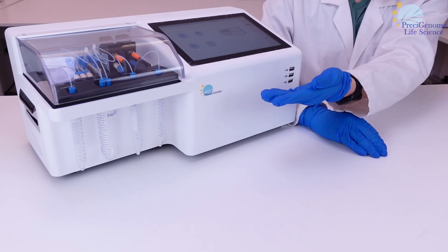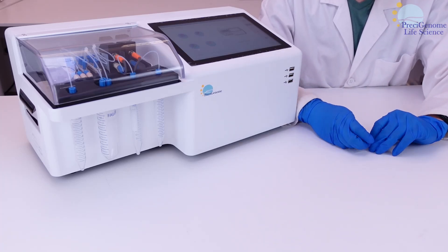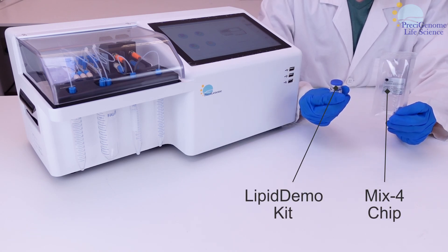In this video, we will go over operation of the nanogenerator FlexM. Used for nanoparticle synthesis, it comes with a Mix4 chip and lipid demo test kit.